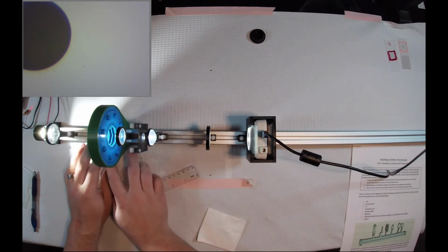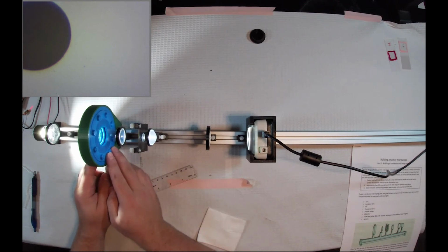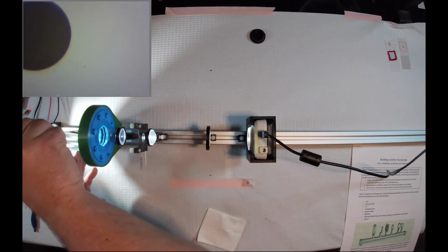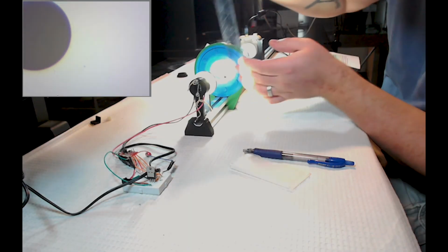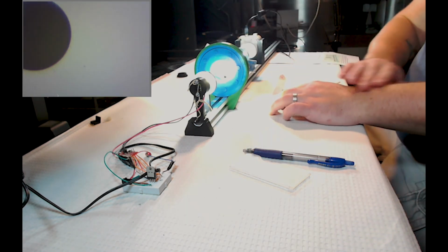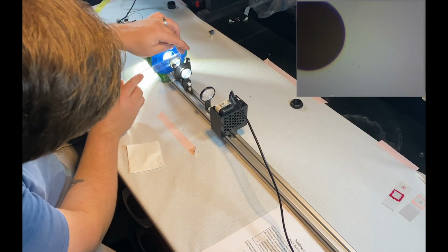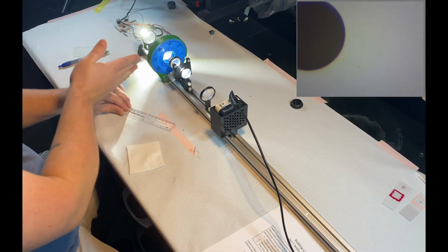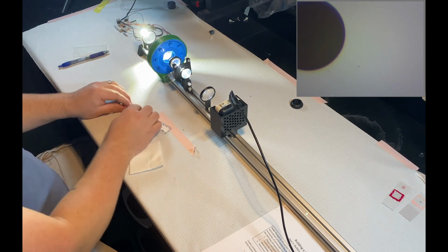It looks like the aperture is larger when it's fully open than the condenser itself. And I can confirm that if I do some quick measurements. This aperture opens up to a maximum of about 32 millimeters from edge to edge, but our condenser lens is only 28 millimeters in diameter. That's the clear aperture that allows light to go through after it's been mounted.